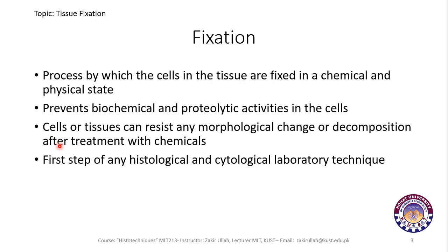And fixation is the first step of any type of tissue processing, any type of histological or cytological tissue examination in histopathology or cytopathology.